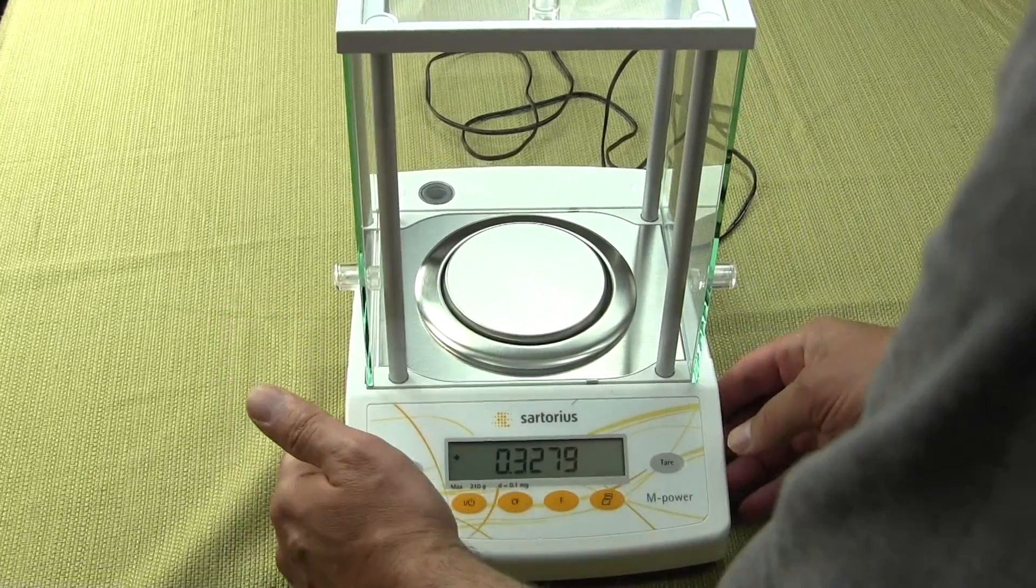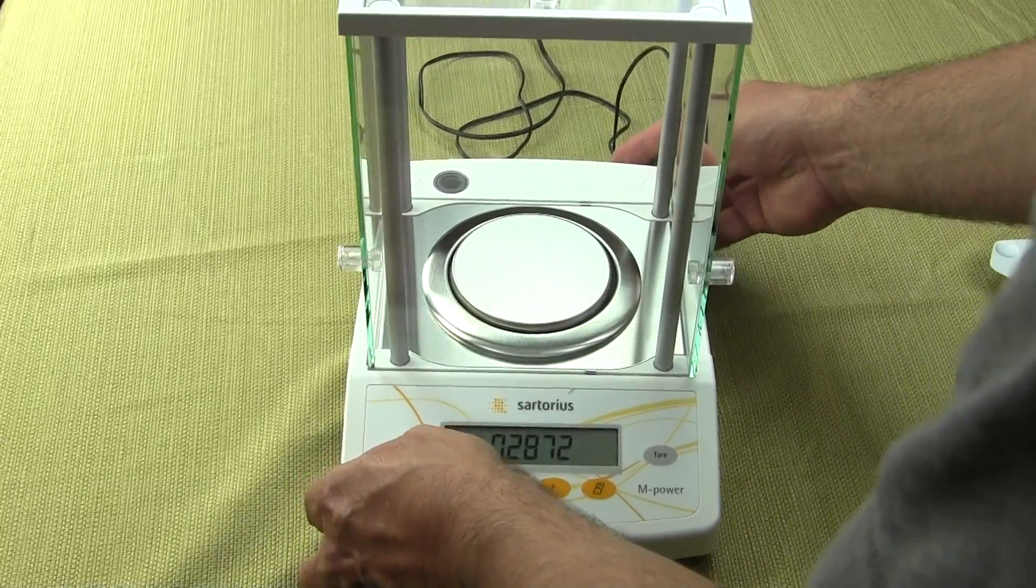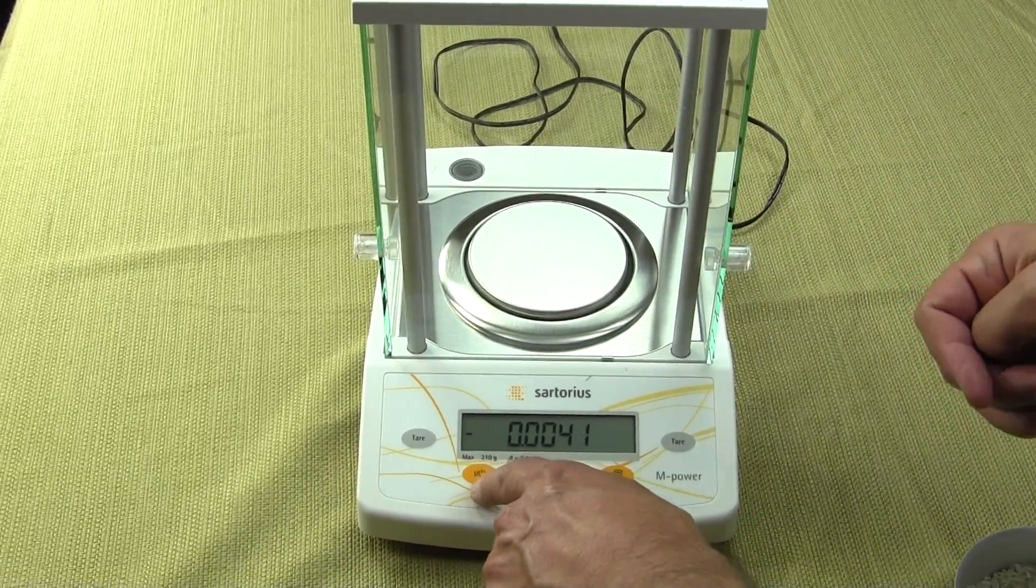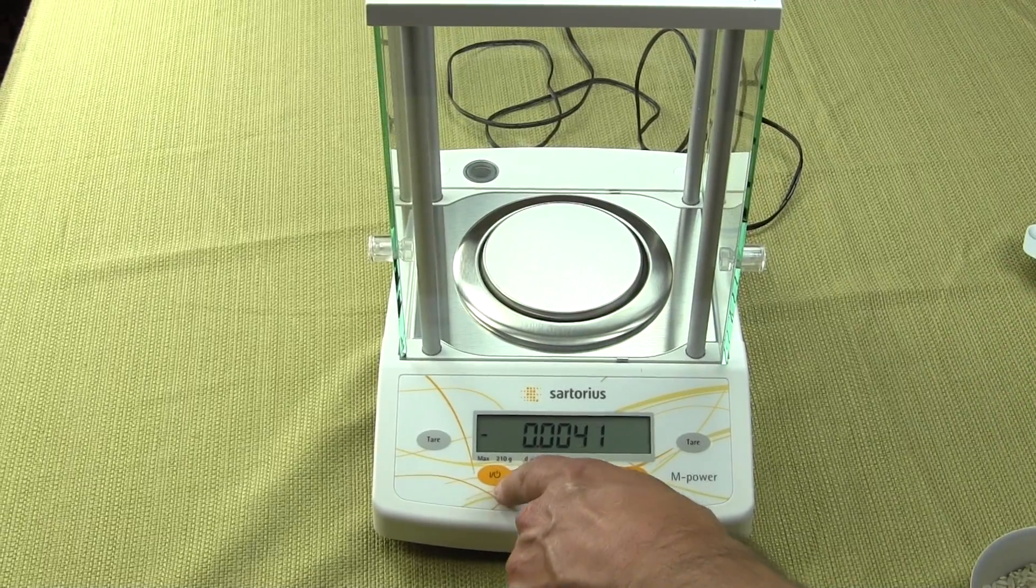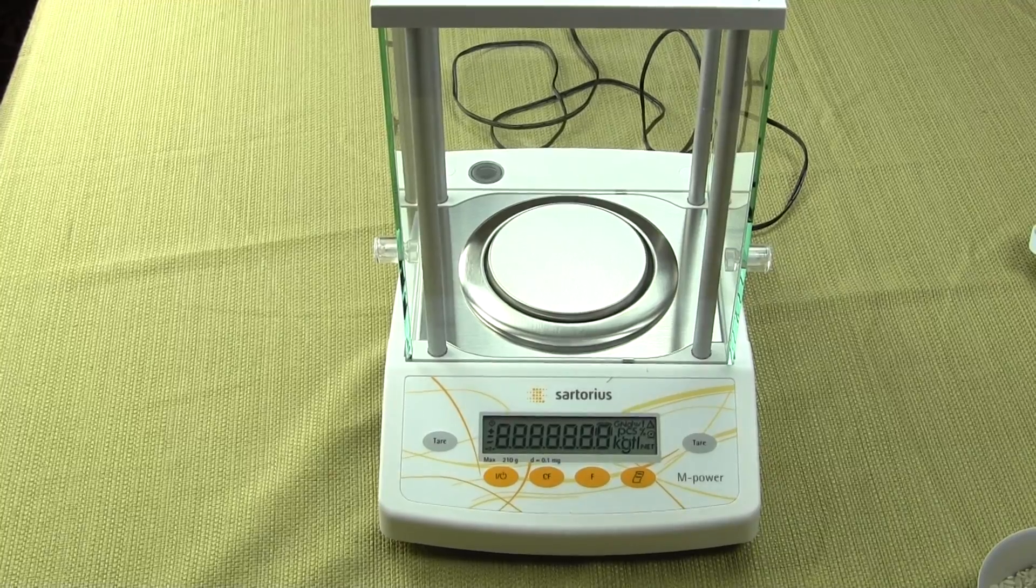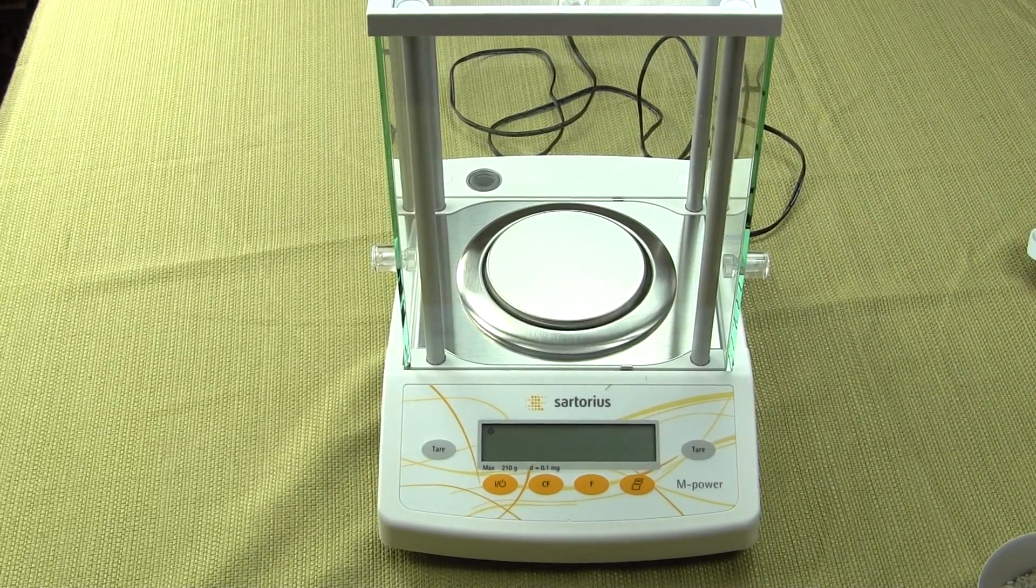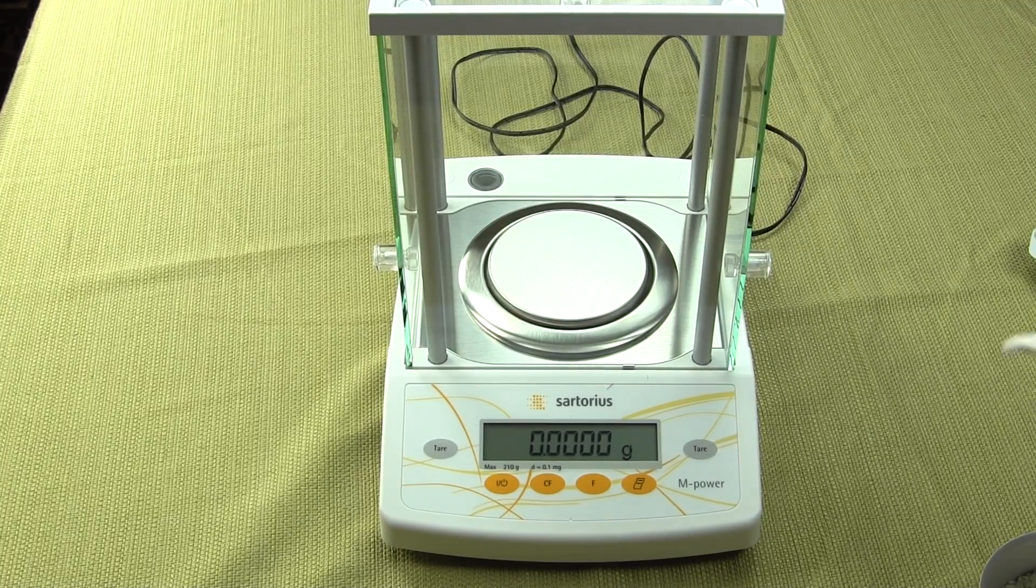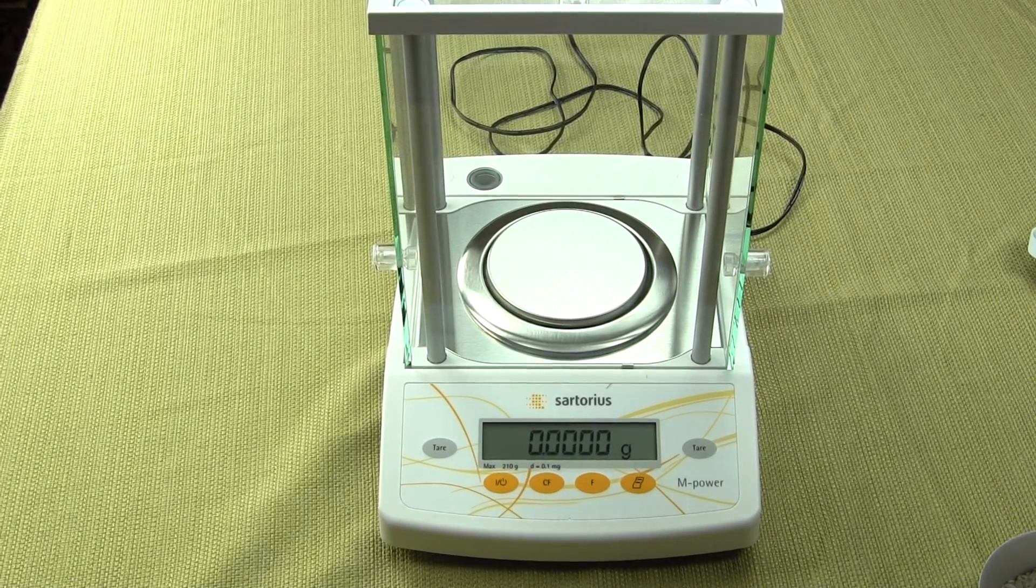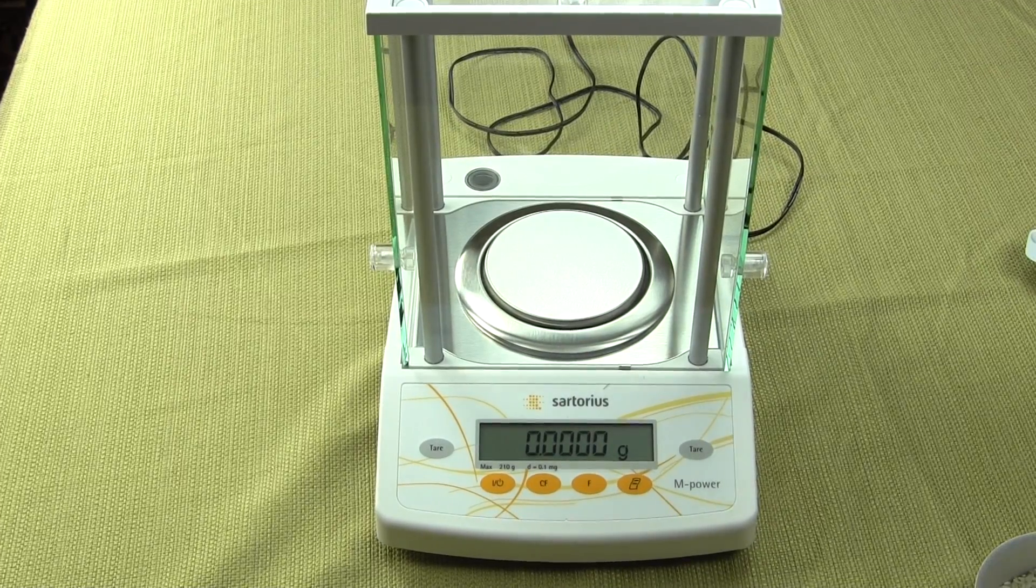Some of the features that you would see in Sartorius' premium quality balances have been removed or they're not incorporated in the entry level. So this is the Sartorius AZ214. There is the AZ124 that would give you 124 grams by a tenth of a milligram. And there's the AZ64. So there's three models in this series.